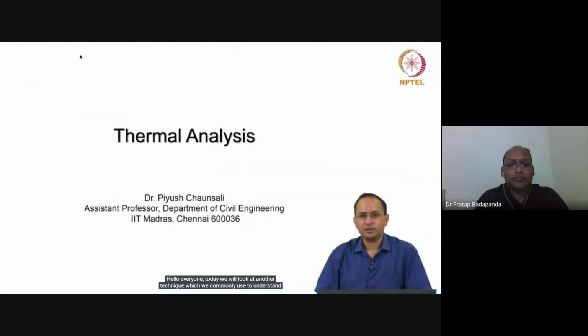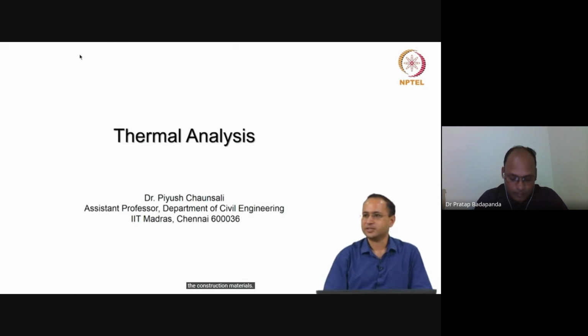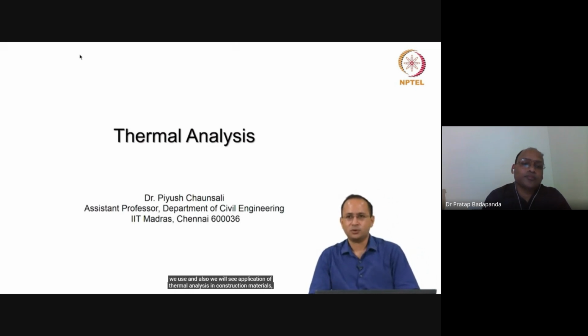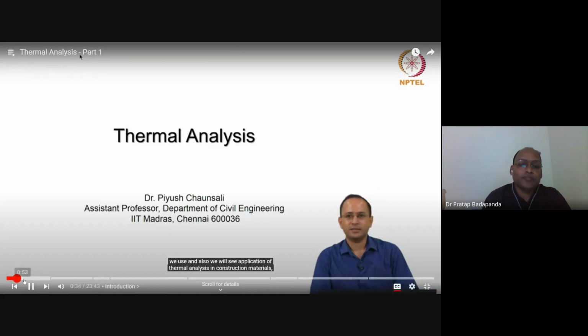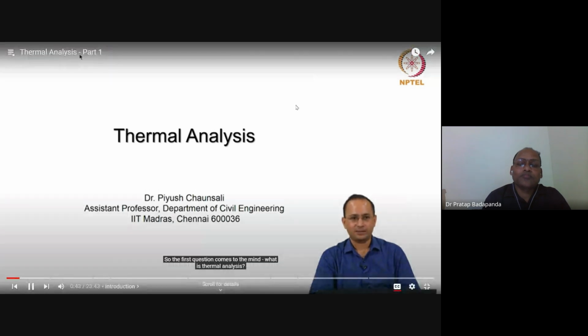Hello everyone. Today we'll look at another technique which we commonly use to understand construction materials. It's thermal analysis, right? So in the next few lectures we'll talk about the principles of various techniques which we use, and also we will see application of thermal analysis to construction materials. So, the first question that comes to mind is, what is thermal analysis?